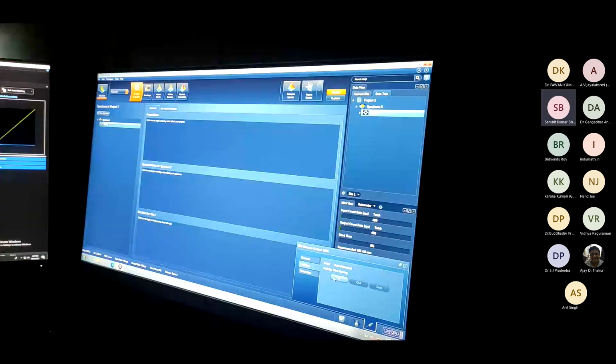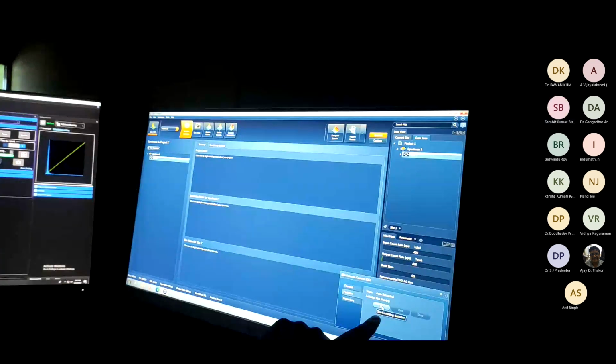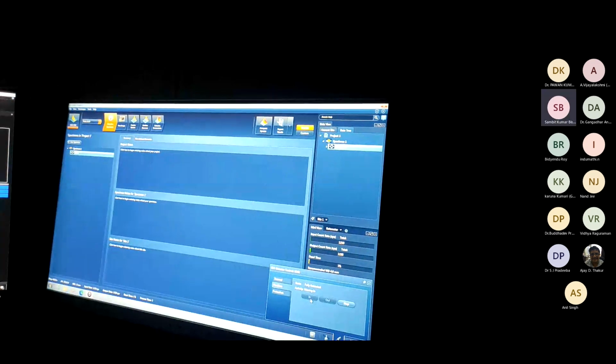Now we can insert this detector, moving in near to the copper. Okay, moving in. Okay, now it has moved. Status is showing fully inserted.